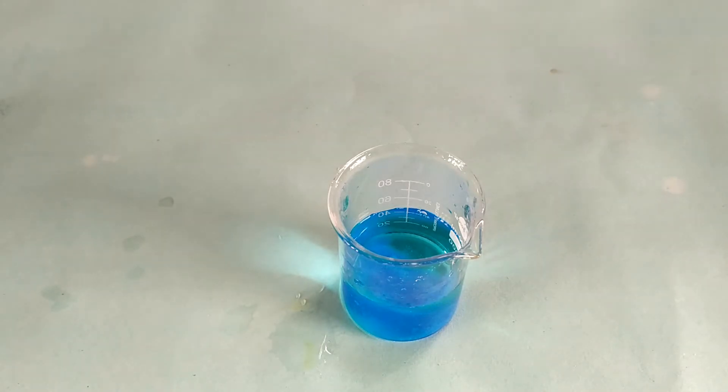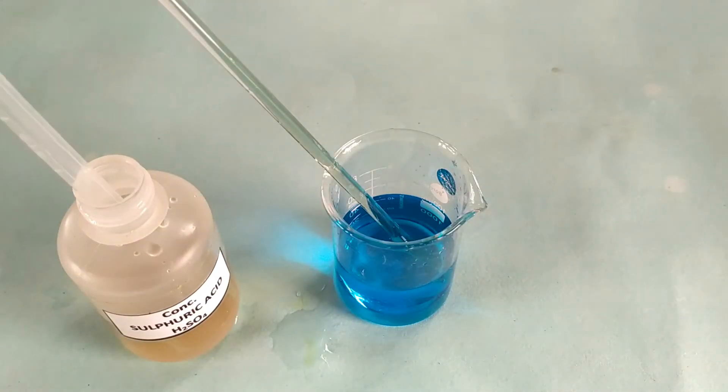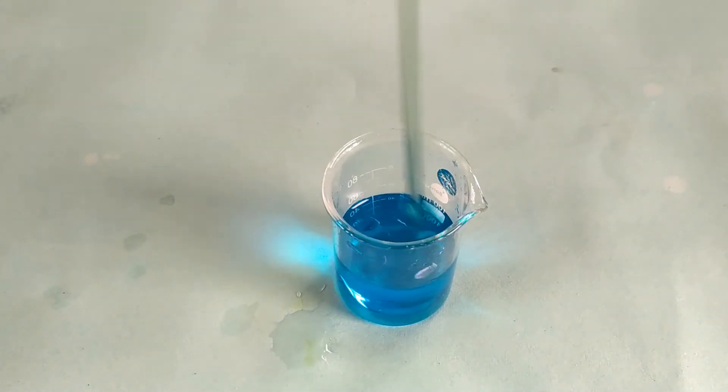Add about 40 ml of distilled water into the beaker and stir the contents. Add about 2-3 drops of concentrated sulfuric acid and continue stirring until the copper sulfate has dissolved completely.